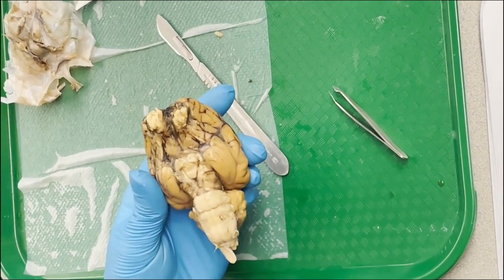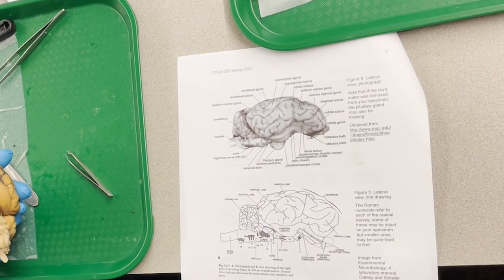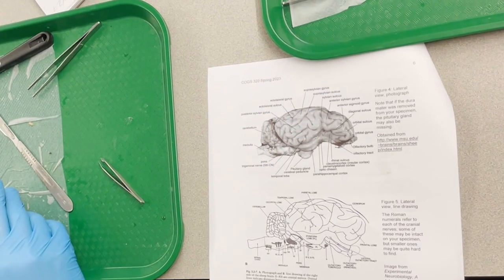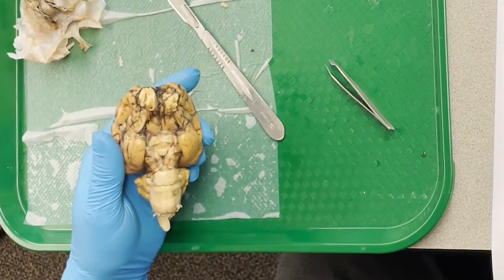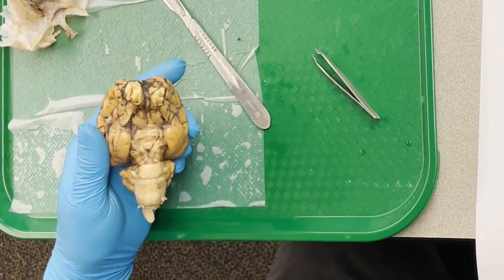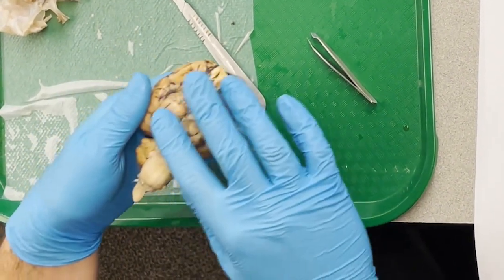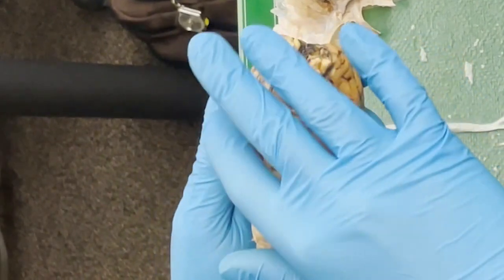There is one other thing, the piriform lobe, which also appeared on page 6 when we were looking at it from the side. It's sometimes called parahippocampal cortex. And this piriform lobe is something that we actually saw in the rat lab as well. So in the most anterior parts of the brain, when we were looking at the Nissl stains, you saw how there was this dark purple squiggly line in the bottom left and bottom right of the brain. If you don't remember right off the top of your head, that's fine. You can go back and look later. But there was a piriform cortex area that did this weird sort of swish mark. And so now we're looking at the outside of that piriform cortex when we look at these bulges off to the side of where the optic chiasm is or was.